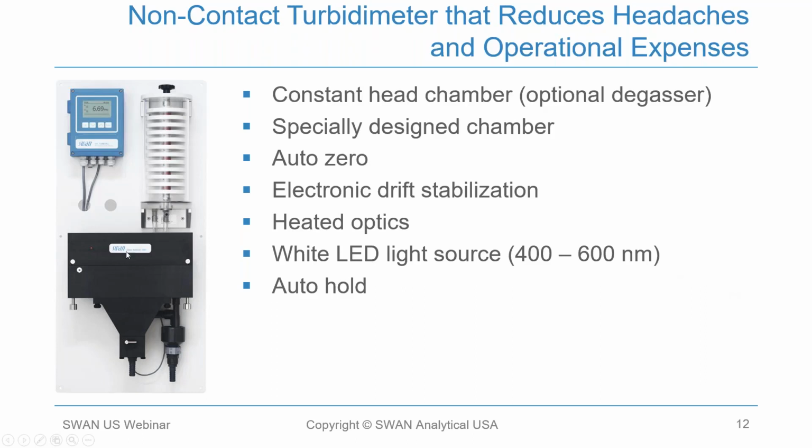What's also nice is because of the way this instrument is designed, the head is attached to the body. So it isn't necessary to try to find somewhere to place parts or to hold the head when you're performing maintenance, which I really like about the unit.